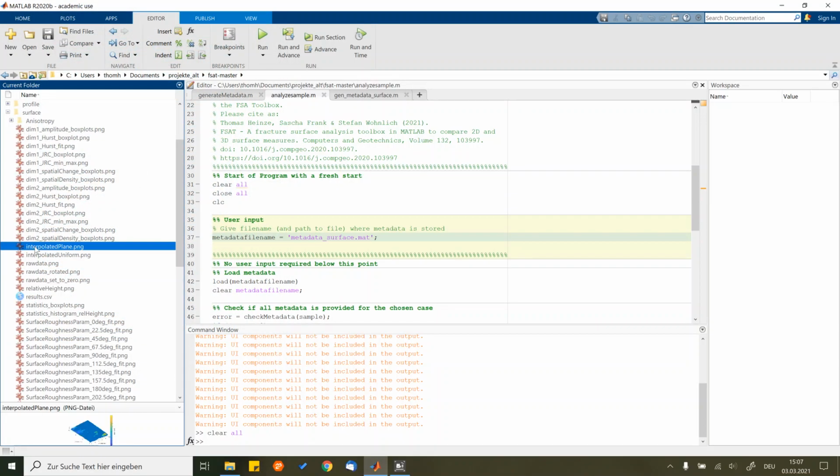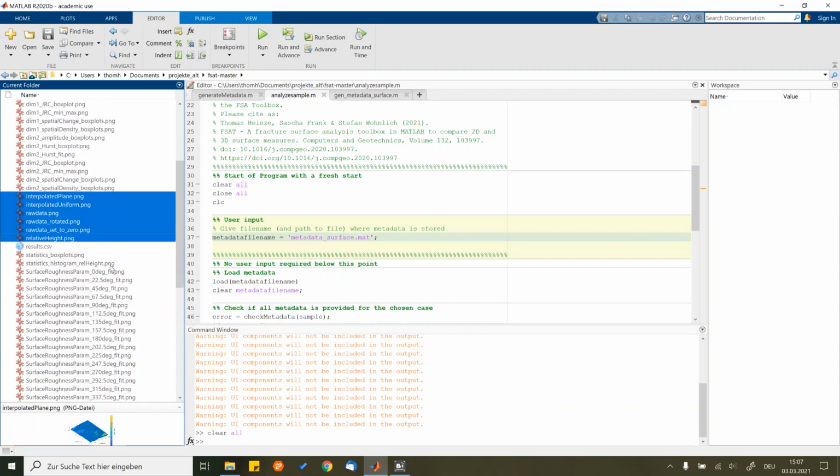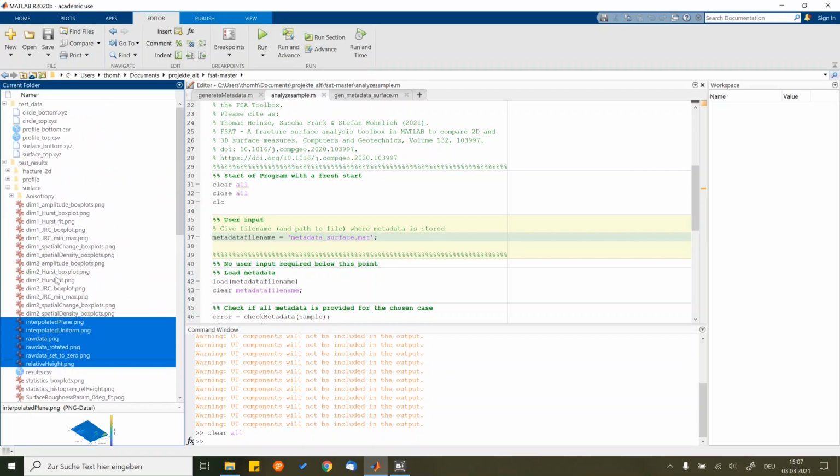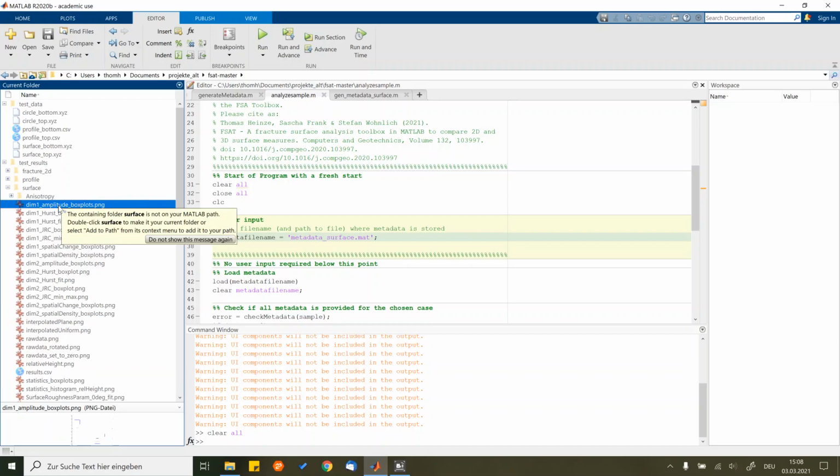So this is the plot that you already know quite well from the height profile. We'll now go also to the other plots that you have already done before. You remember that when you were looking at the single height profiles, in the results table there were a lot of empty values because you just have one profile.